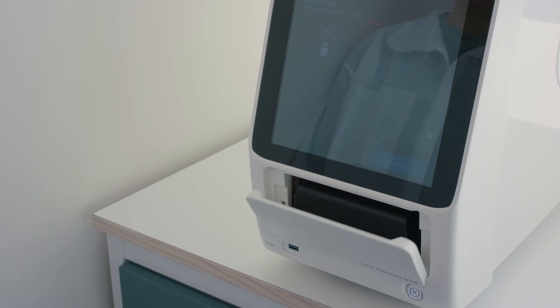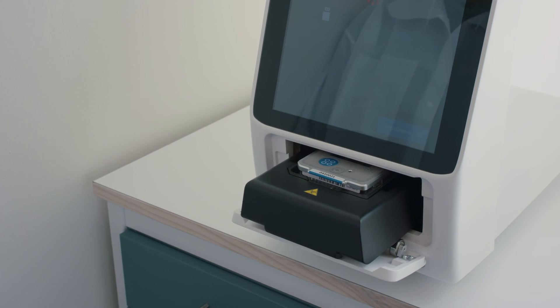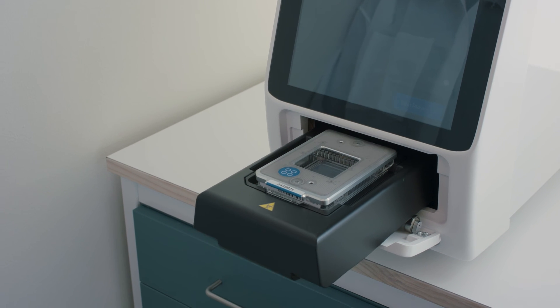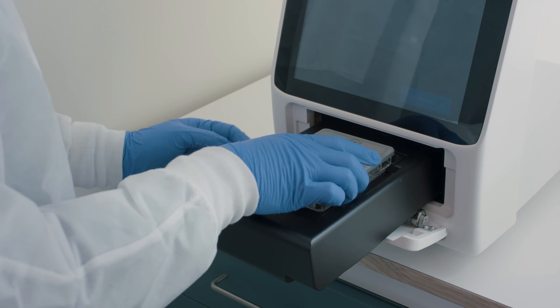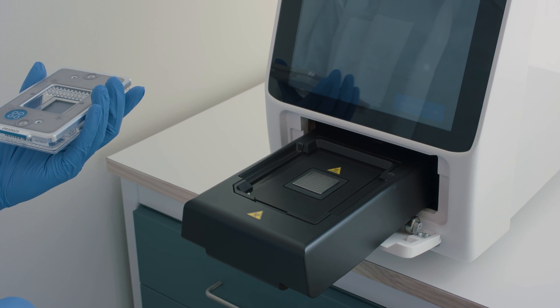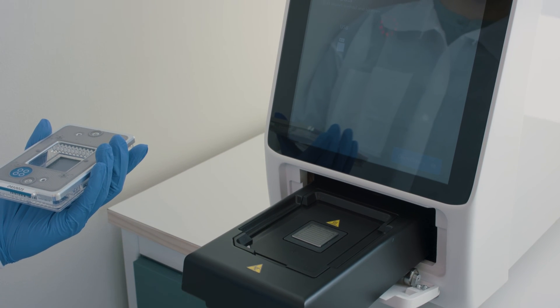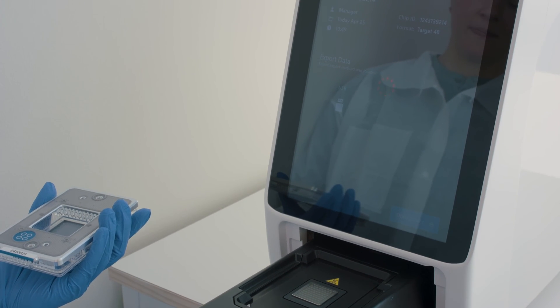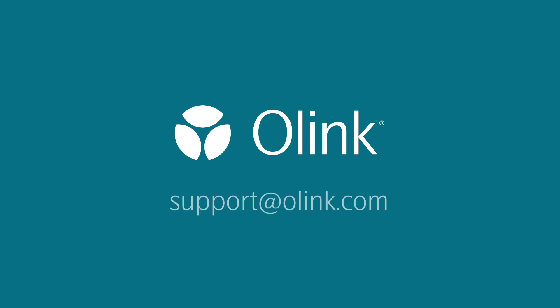Now you can analyze the exported data using the NPX Signature software. This concludes the Olink Target 48 and Flex workflow on the Olink Signature Q100 instrument. For further help and advice, contact our knowledgeable support team at support at olink.com.